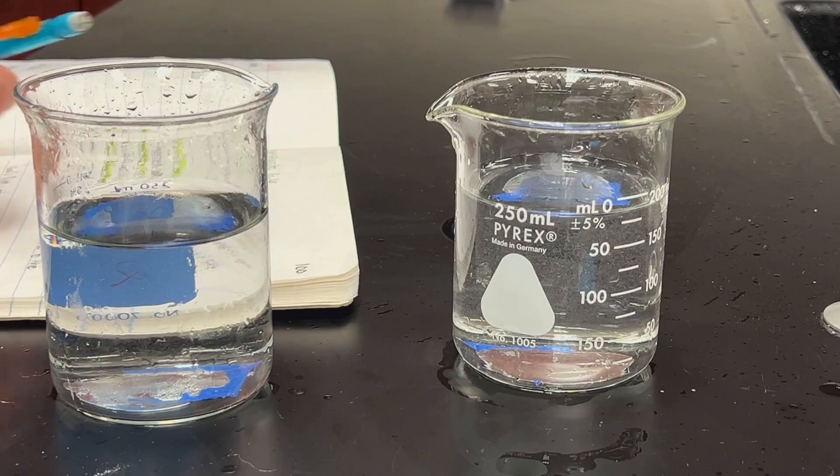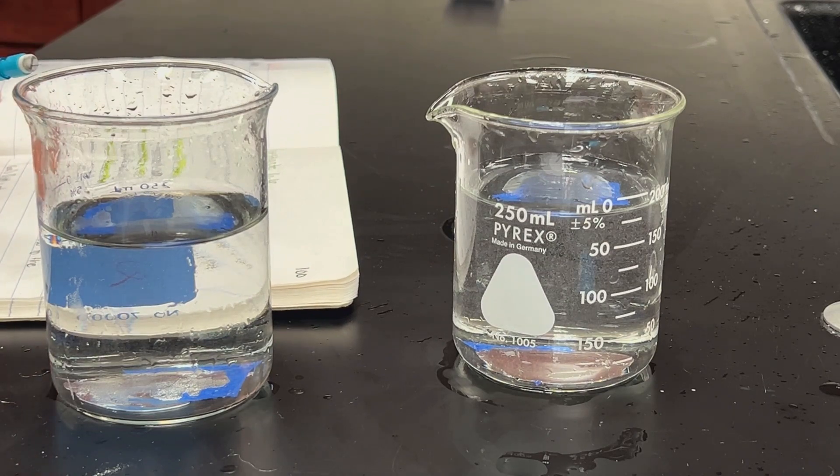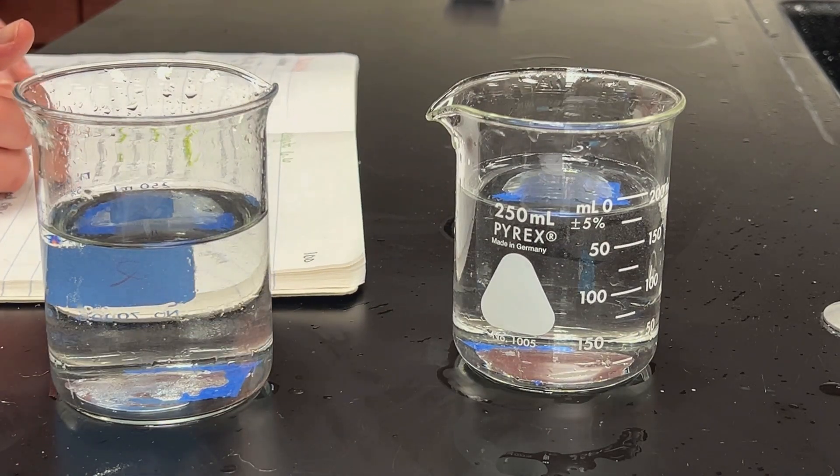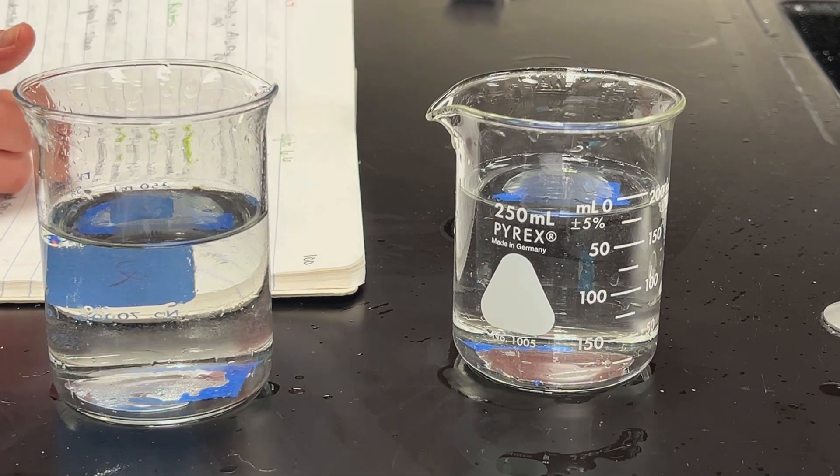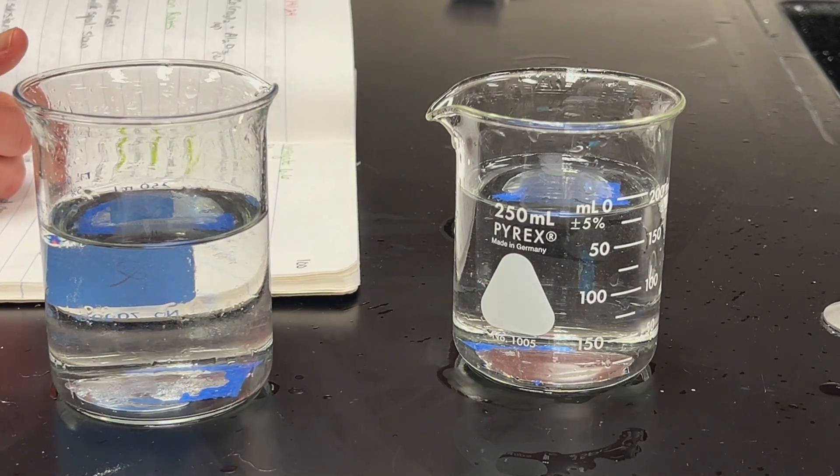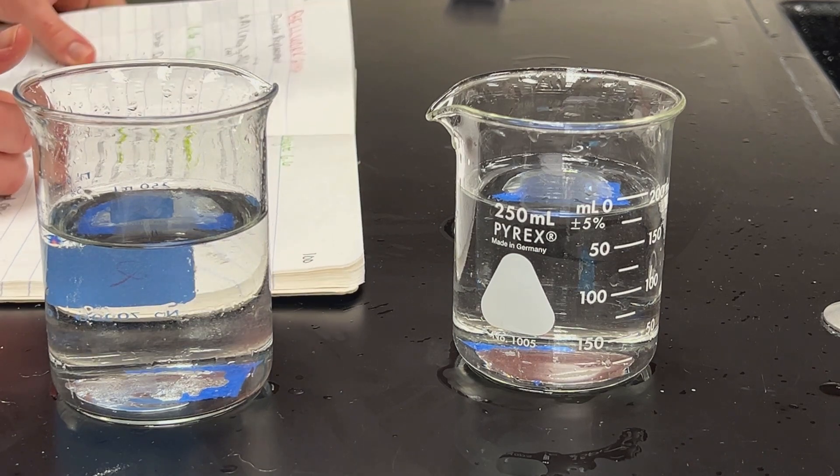Because we're in 7. Wait, is this 7? Okay, number 7. Prepare two beakers each containing equal amounts of 200 milliliters of room temperature water.